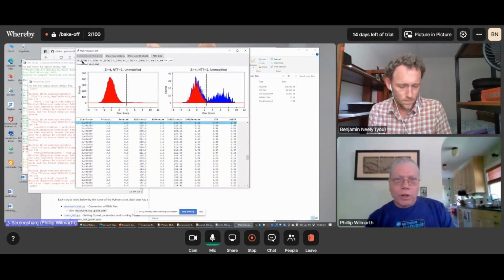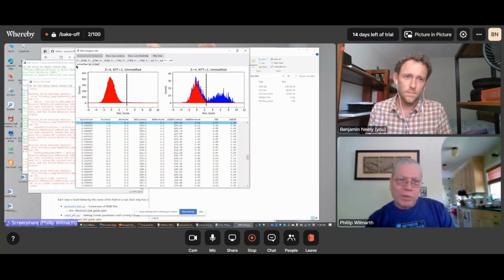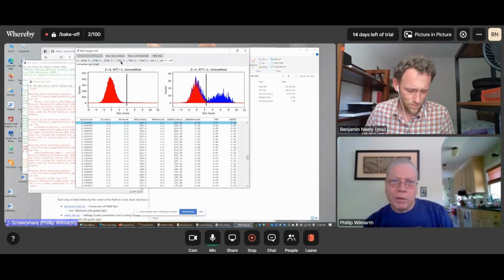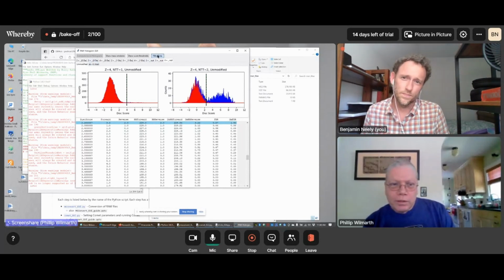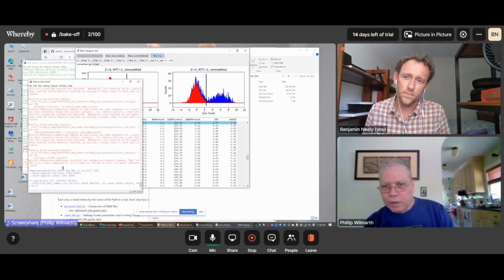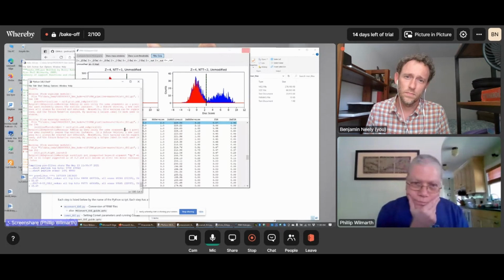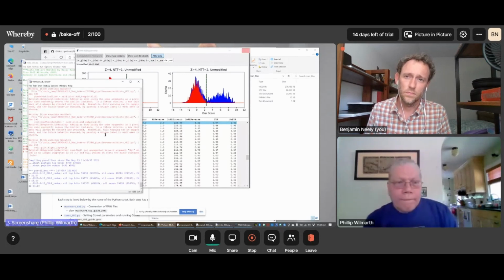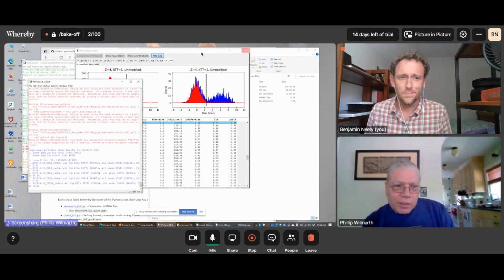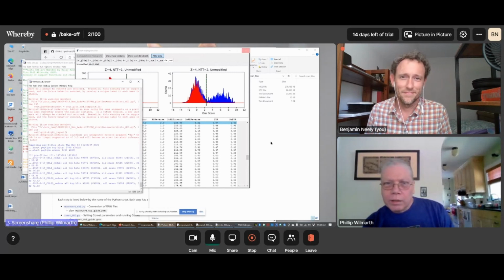So once we've worked all the way through the top tab and looked at all of our unmodified and modified ones and set all of our score thresholds, then we can filter the data. And the console window now tells us that it's chugging through the data. This takes a little bit of time here. Since we lost some time, we can do a Control-C out of this, because this data's already got.